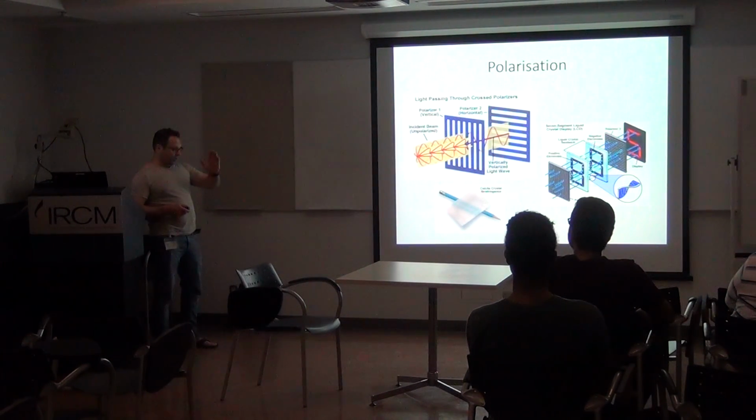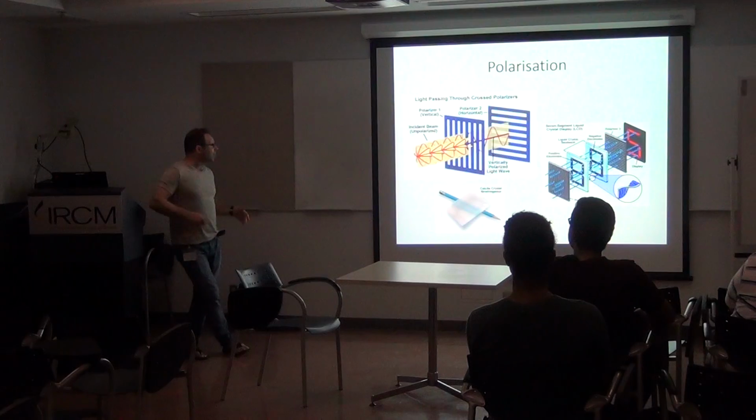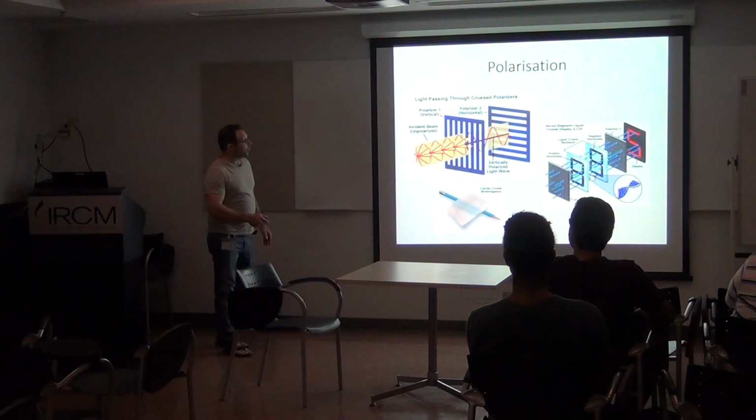Lasers will be in a certain polarization, mostly because all photons are in the same group and will have some properties which we define as coherence. Okay? And so the polarization will be used in many systems, mostly for contrast, because a polarization will have a certain angle, but we can distinguish it from another angle by using what we call a polarizer.